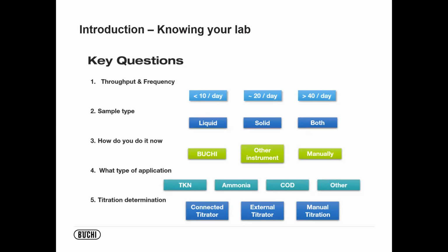These are all things that will help us as consultants and manufacturers to make sure that we meet the total demand of your lab, and then likely the titration aspect of it. Throughout the market, there are options for it being completely seamless with automated titration, working hand in hand with distillation, or the more old school way, taking the distillate and running it to the titration separately, manually doing it, which I'm sure is very time consuming. Hopefully no one's manually titrating today, but that's what we want to look at.